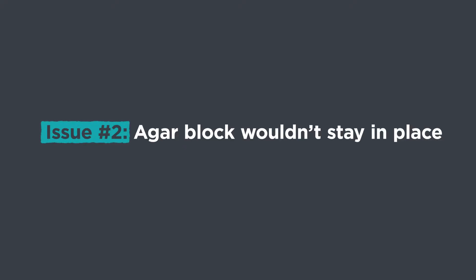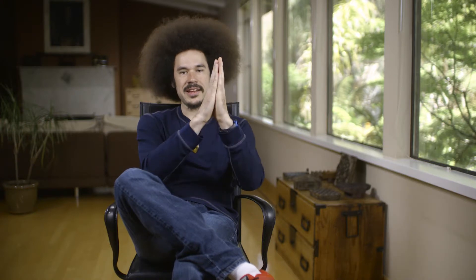But once I was able to get it out of the original plate and put it on top of the seedling, the next pressing issue I ran into was that it would not stay in place. I would take this small block of Agar and put it onto the seedling, and because the root has to grow vertically, I would stand the plate up — and then this block of Agar would just fall off because of gravity. That was something I did not anticipate.